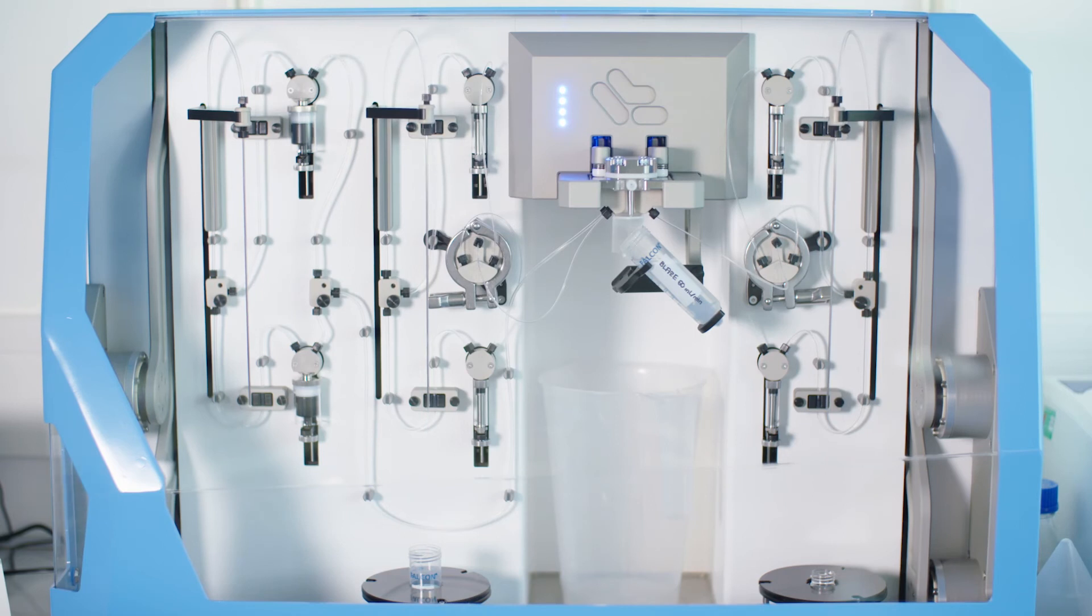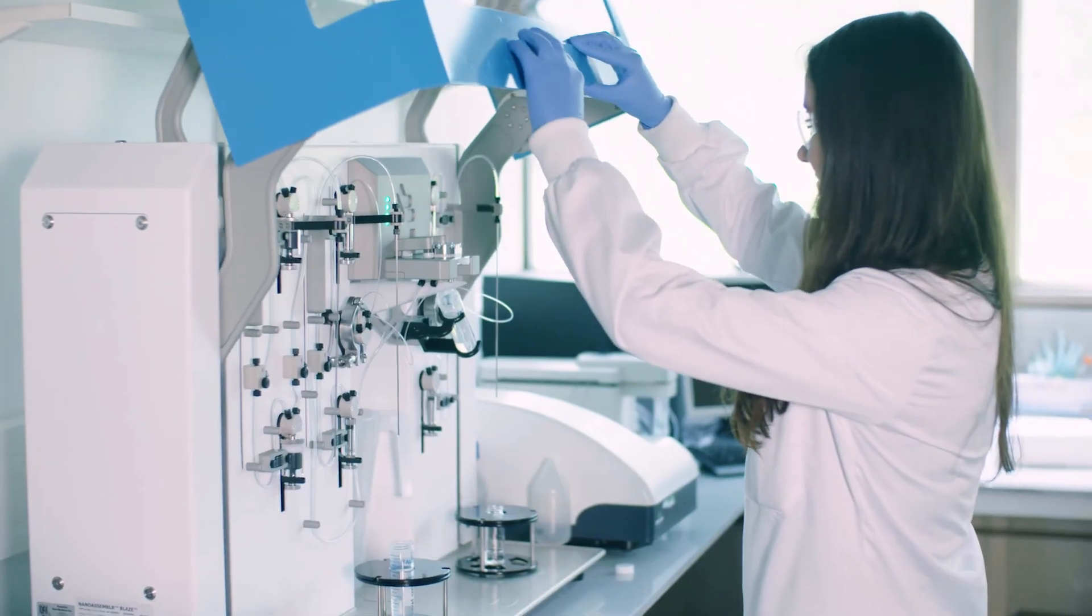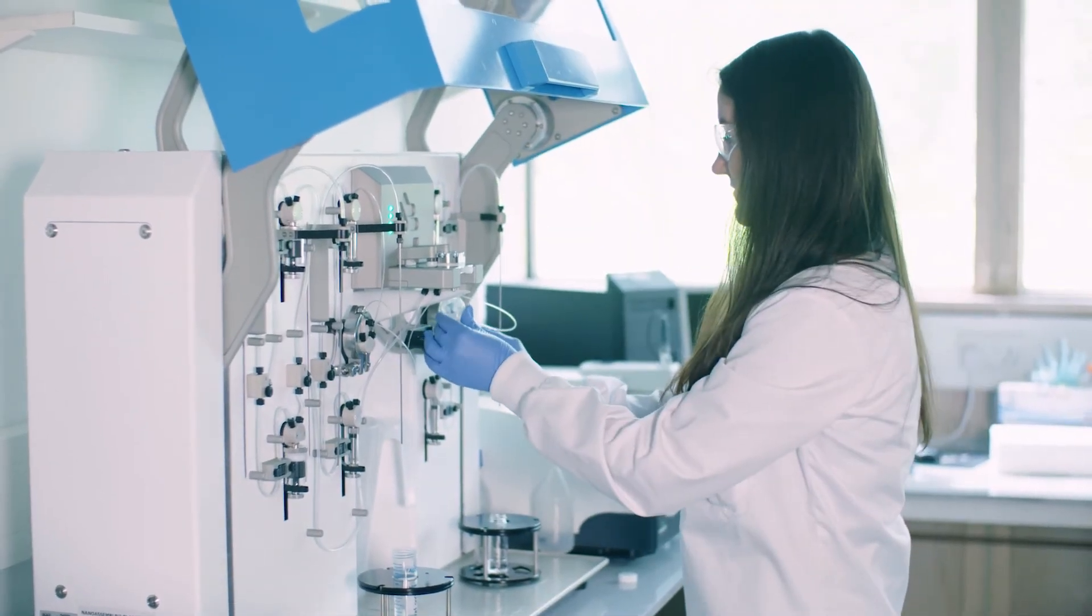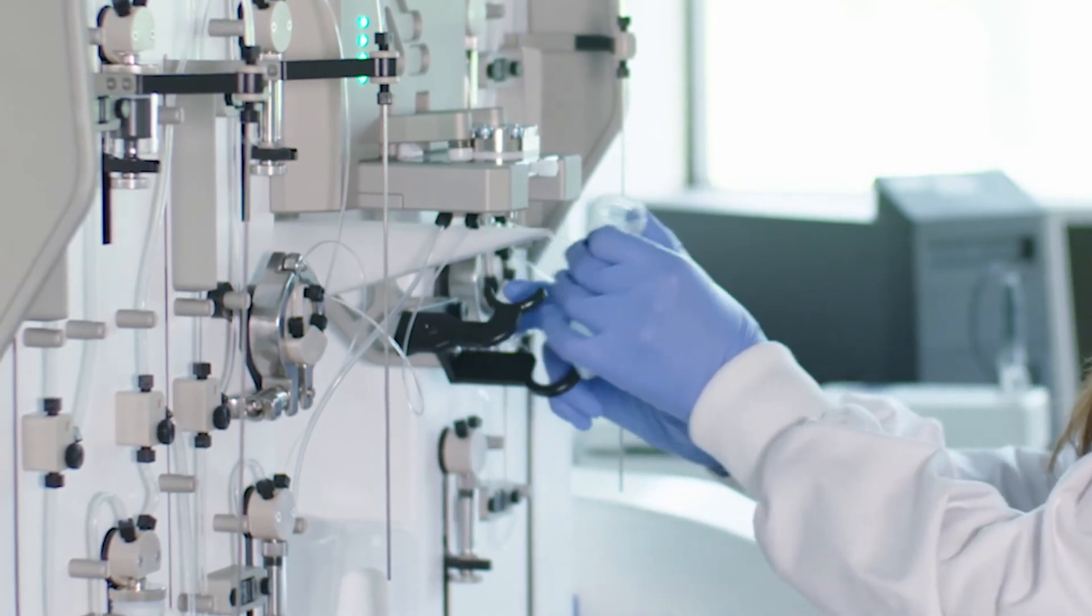Together, NextGen and Blaze greatly simplify scale-up of the unit operations for both particle production and inline dilution, so you can focus on scaling upstream and downstream processes and building that data package to support regulatory applications.